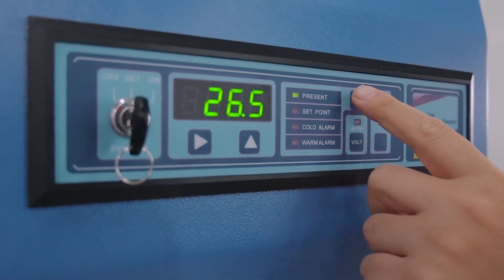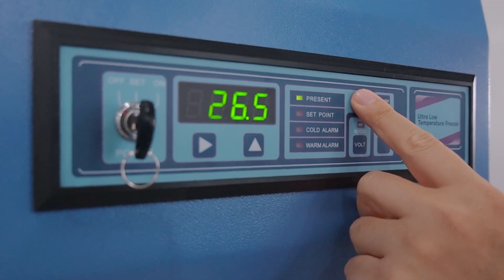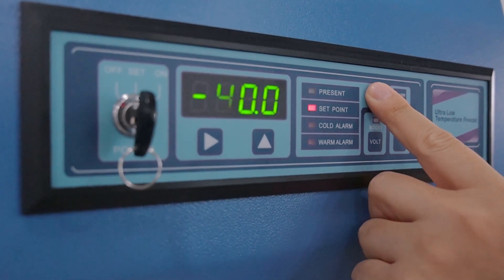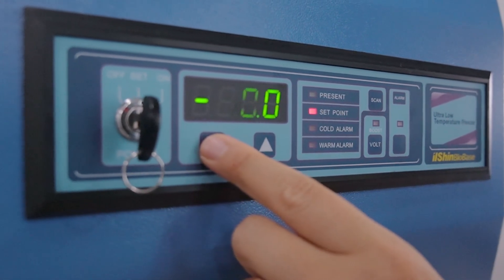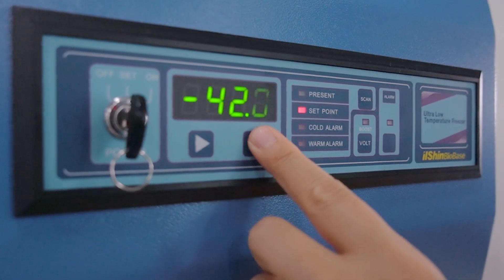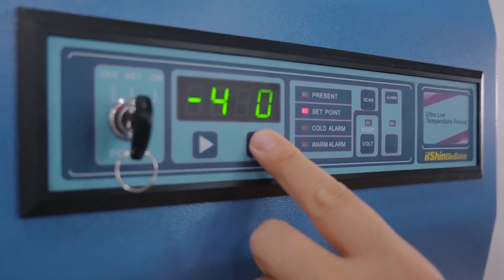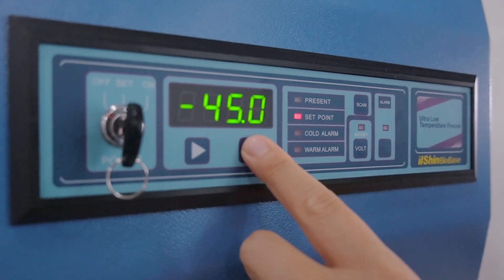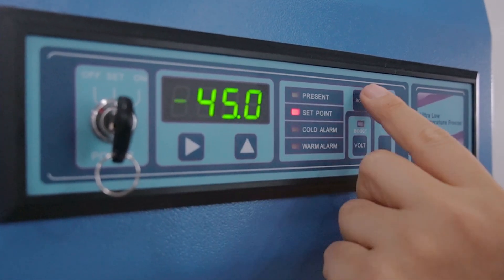When user wants to change set value, simply use arrow button to change the value and push scan button. Then the changed setting is applied.